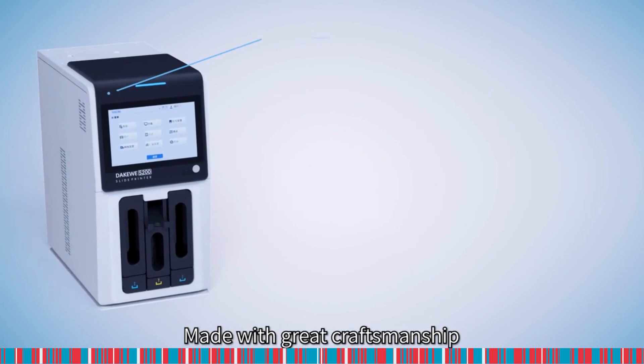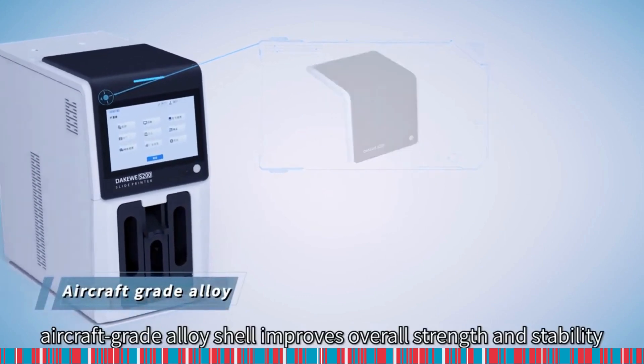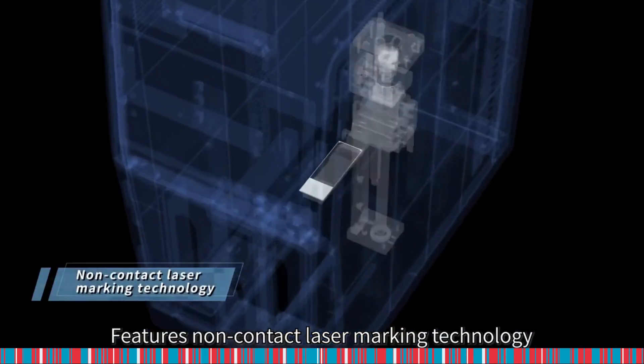Made with great craftsmanship, aircraft-grade alloy shell improves overall strength and stability. Features non-contact laser marking technology.